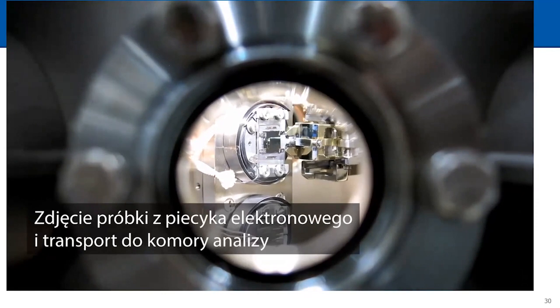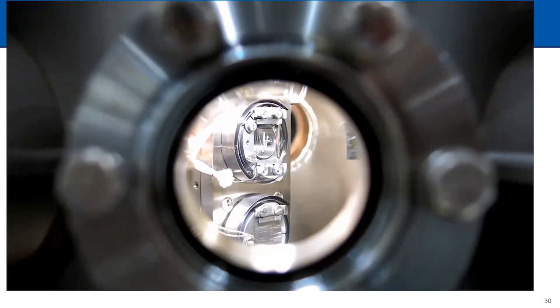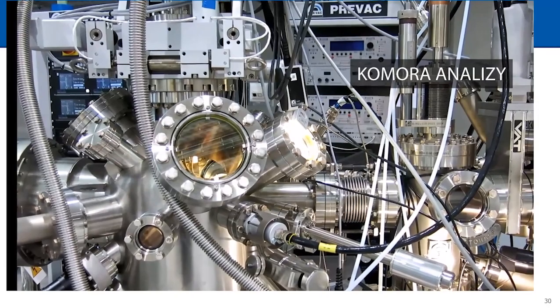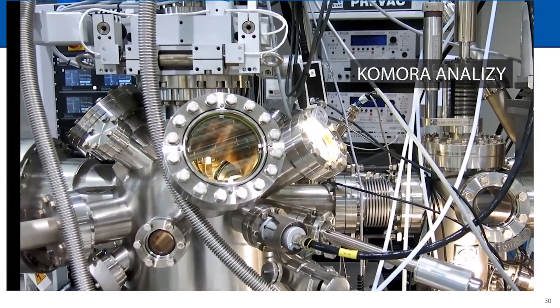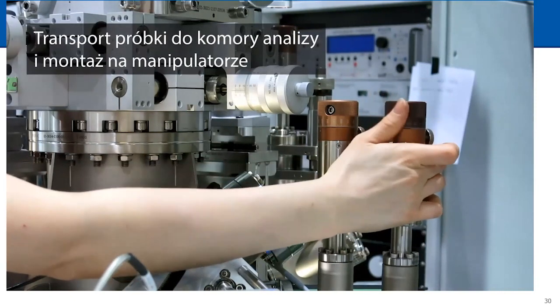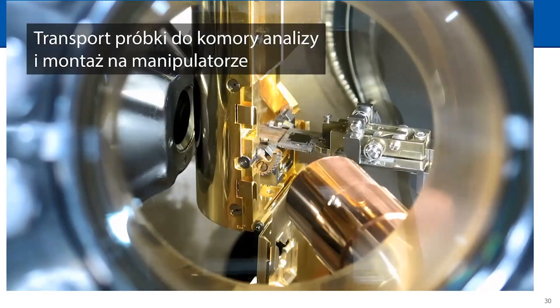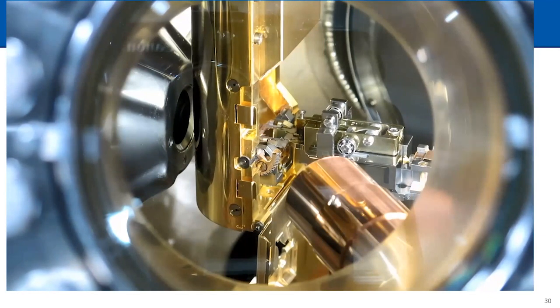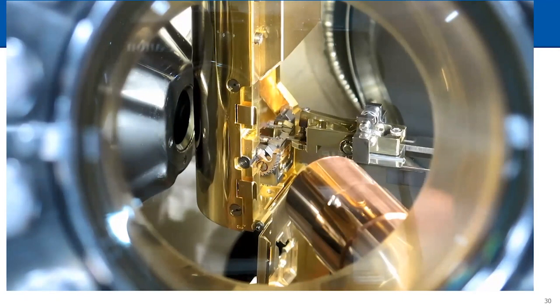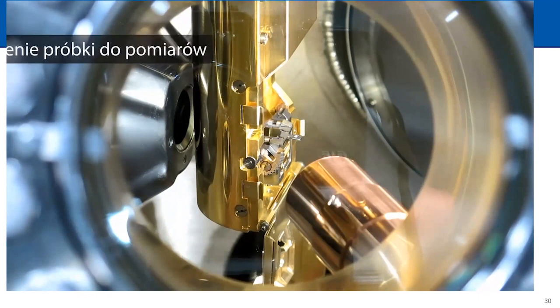And next, we can remove the sample from the electron beam heater and transport it to the analytical chamber. It is easy to use the linear transfer and go to the analytical manipulator. The transfer mechanism looks like a pen mechanism, and it's simple to use.